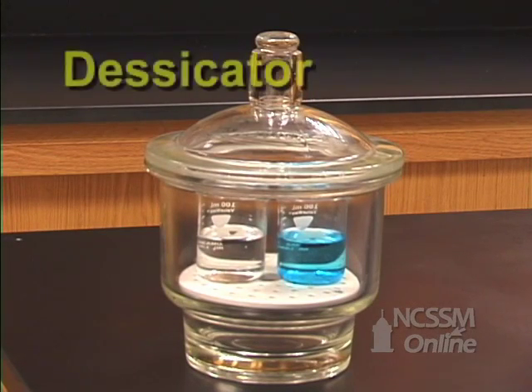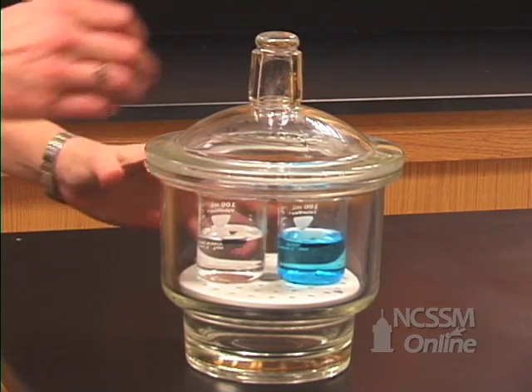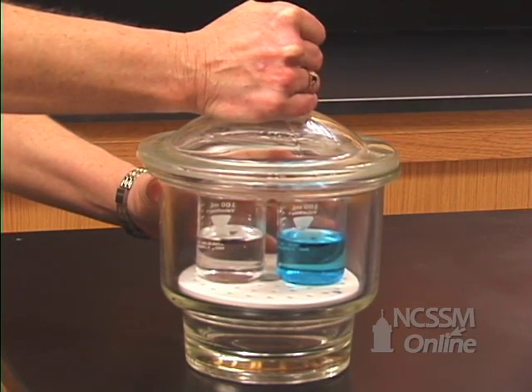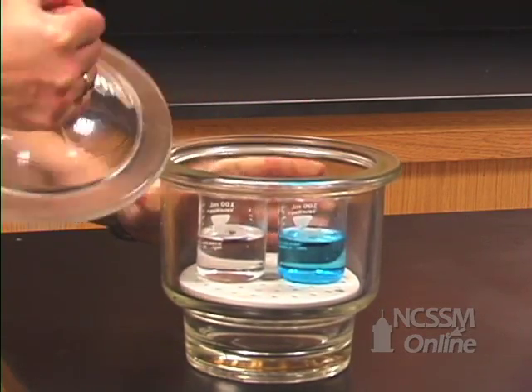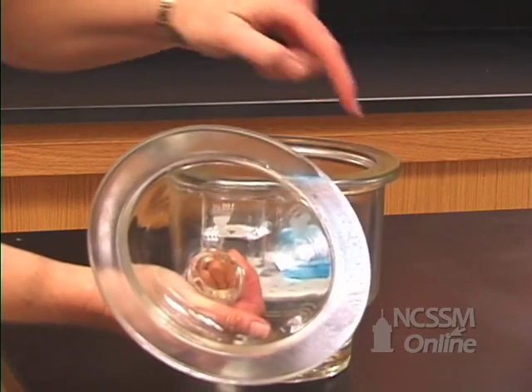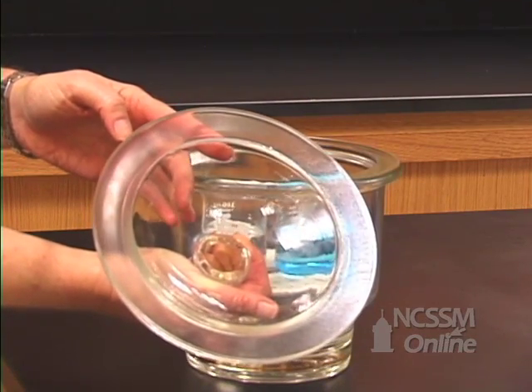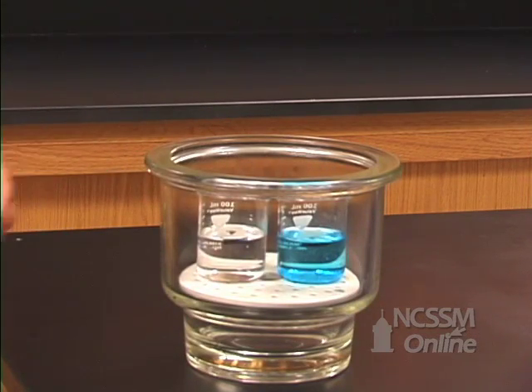This is a desiccator. A desiccator is a closed system and normally you would have a desiccant, something in there to absorb moisture. We're using it as a closed system — it's just a glass container with thick walls, and it has a smooth ground glass top with an oil seal around it, which is what allows it to make an airtight container.